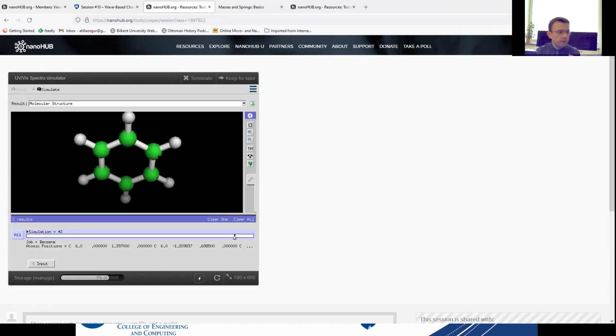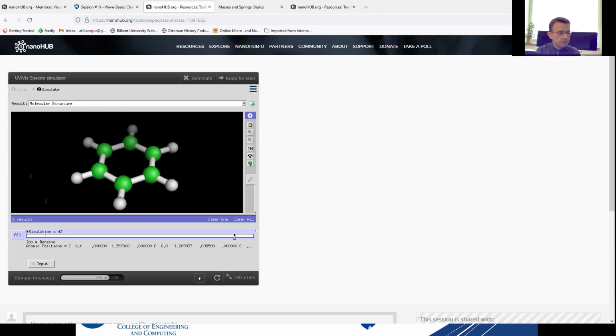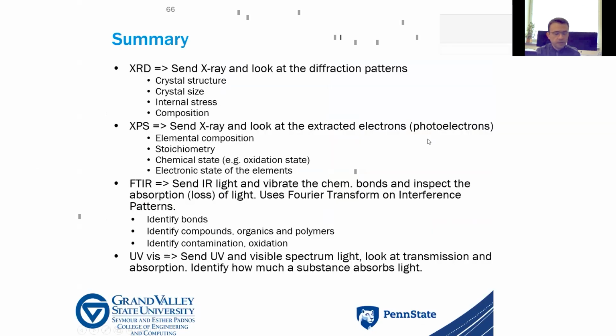benzene can be coming from anywhere, like if you went to a gas station, you get some benzene from there. You see the compound structure is slightly different. So let's compare the two, slightly different, and that will show itself in the absorption spectrum. So we do not have that particular peak in there with the benzene. This is pyridine, this is benzene. So they give you different peaks in there.